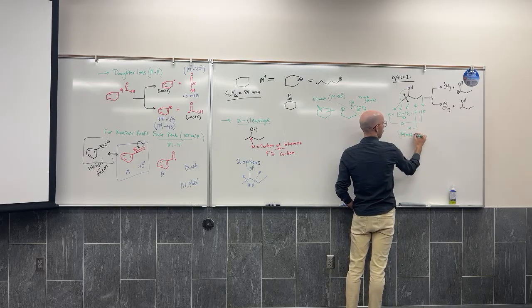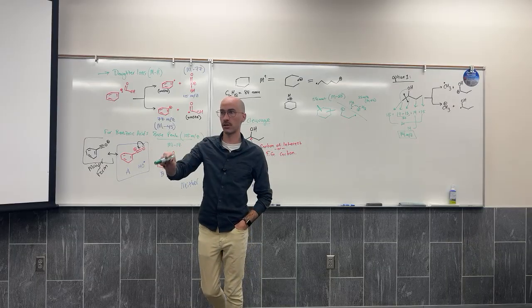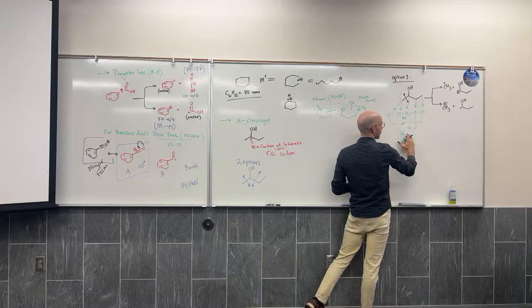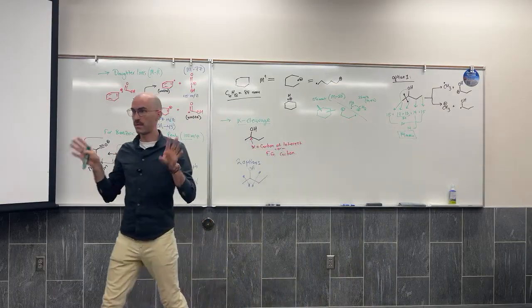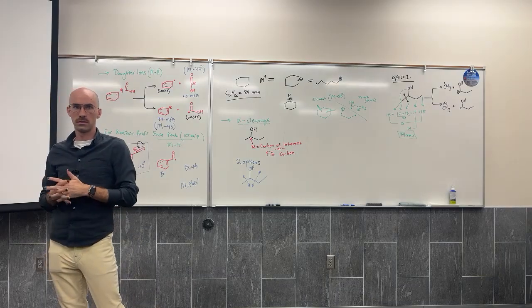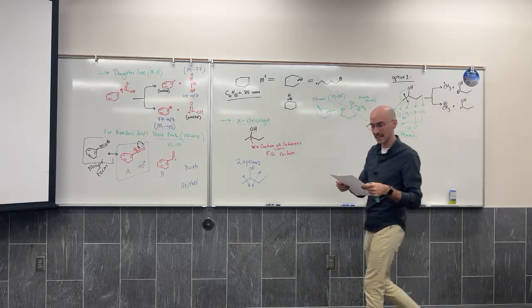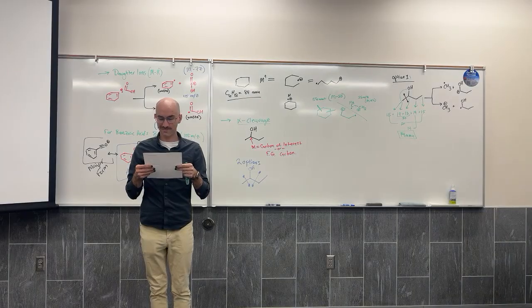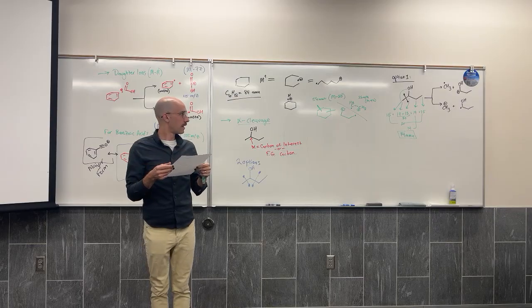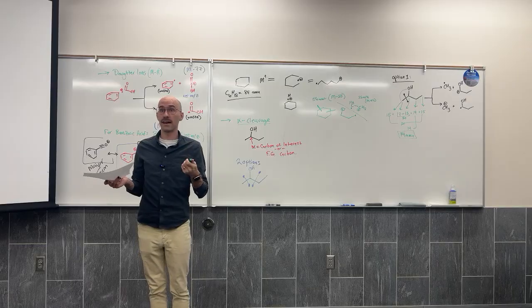74 mass per charge, if it's the molecular ion. So actually, I'm sorry, I shouldn't even say that because that doesn't have a charge on it. 74 AMU is the mass of the molecule. Do we see a molecular ion for this structure? Do we see a signal for the molecular ion at 74? Maybe tiny. 74? I agree. Actually, that looks like it's at 73. And so not really. There's not really a molecular ion for this compound, despite the fact that it has lone pairs.